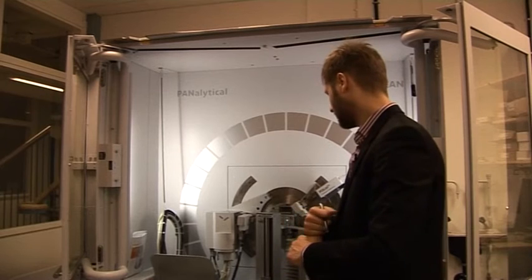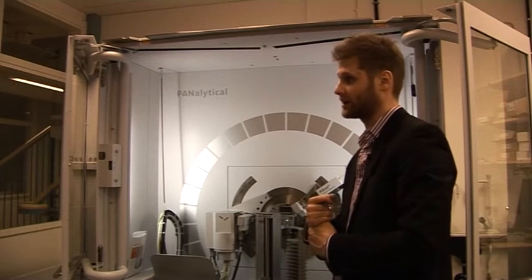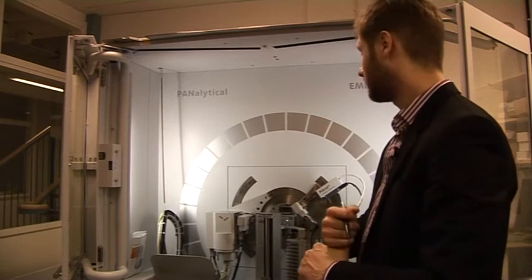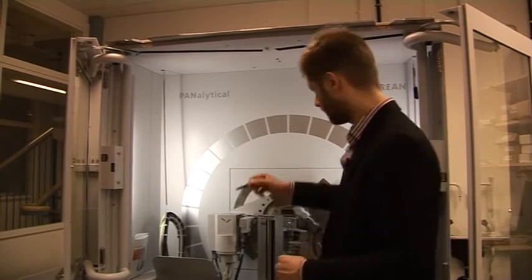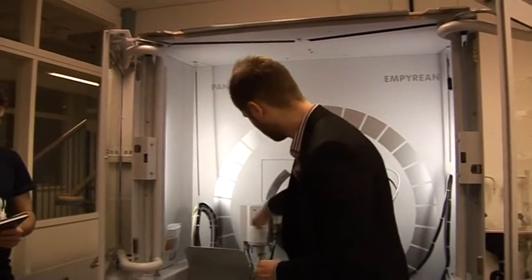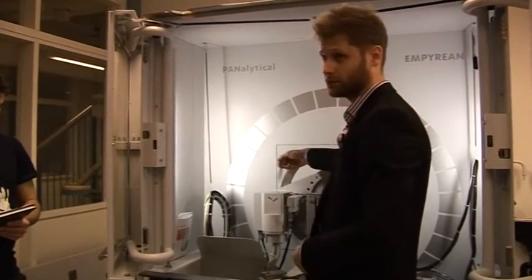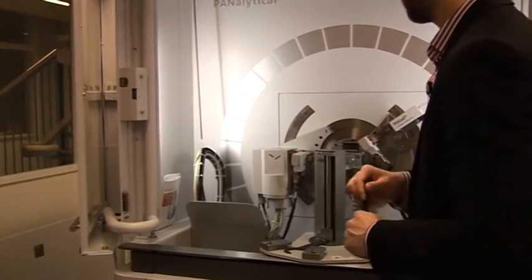We have a standard copper X-ray tube, so it is copper K-alpha radiation that we are getting out from that tube. The tube is here inside this chamber. It has to be cooled down all the time because there is a lot of heat production meanwhile we produce some X-rays.